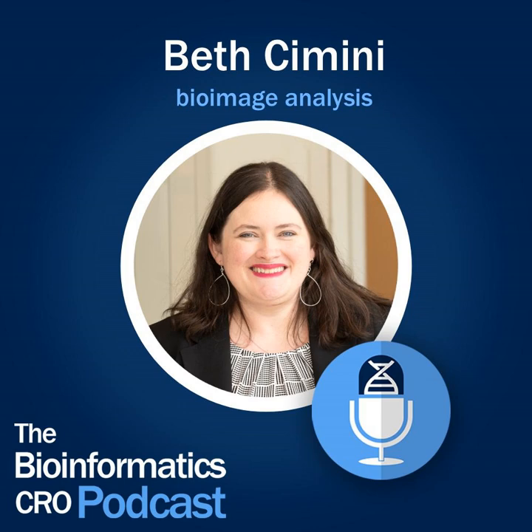What kinds of scientific questions tend to bring people to bioimage analysis? Yeah. Light microscopy is still one of the best things, and certainly the most cost-effective thing we have for doing anything where you want to do single cells. We've been looking at single cells under microscopes, again, for hundreds of years, and especially anything where you want to do biology over time. Of the omics that are out there, we can really only reliably do omics over time in light microscopy, because it's the only omic we can do while the cells are still alive and still happy and still mostly doing their normal biology.